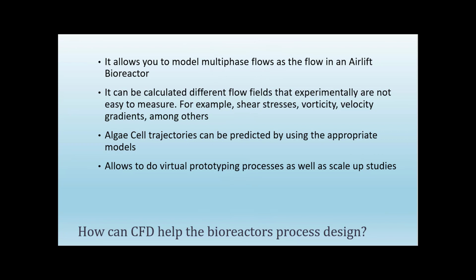According to the before mentioned and to our area of interest, the following question arises. How can CFD help the bioreactor's process design? CFD can help bioreactor designers in different ways. For example, it allows you to model multi-phase flows as deployed in airlift bioreactors. Also, it allows you to calculate or predict different flow fields that experimentally are not easy to measure, for example, shear stresses, vorticity, velocity gradients, among others.